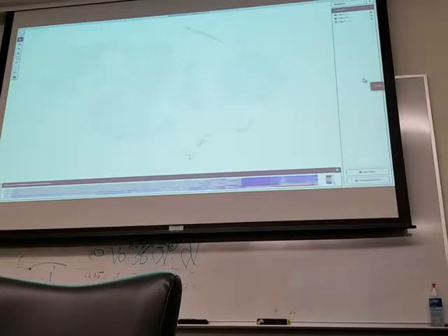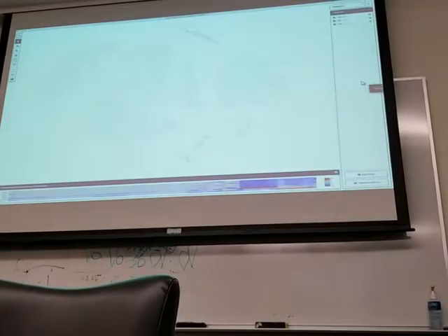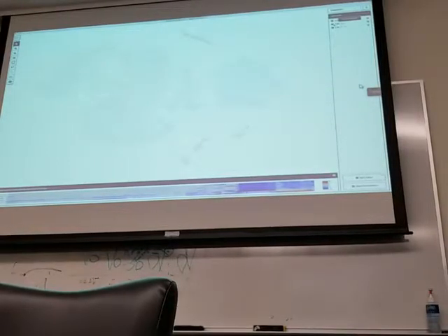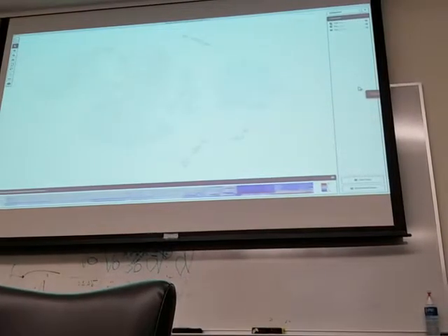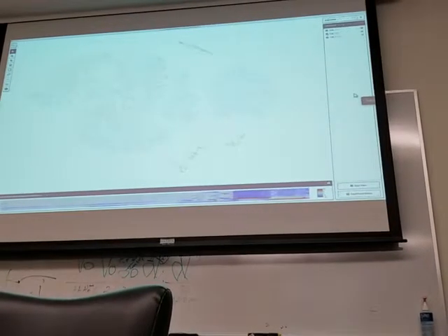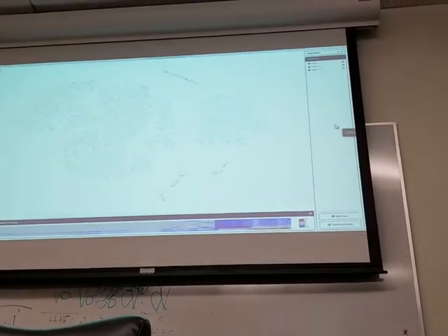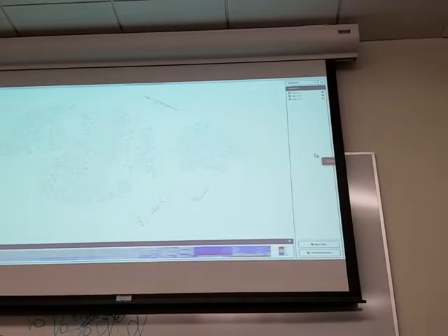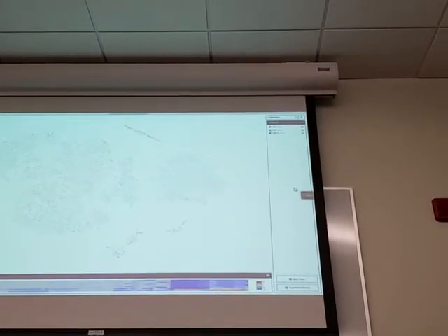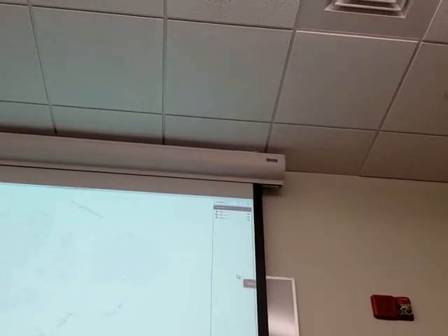Yeah, 135 is me. Your healthy control, right? Yeah, right. They're not very healthy. I'm not too healthy. My B cells are a little screwed up. And it's not like I'm uninterested, because I do have a little problem there, and it might be interesting to figure out what it is, but I'd like to look at 135. I could write a case report on 135. I wouldn't mind doing that, because I know the history of it, too. But anyway, that's something else. If you want to write a case report, there is one.